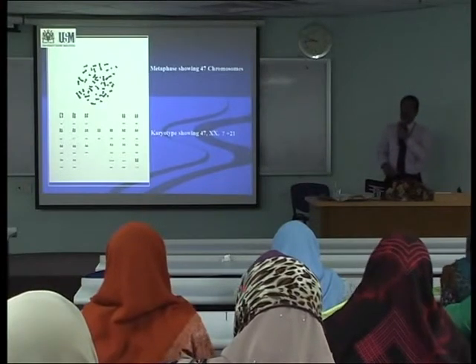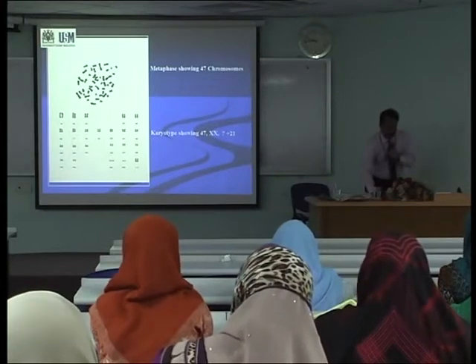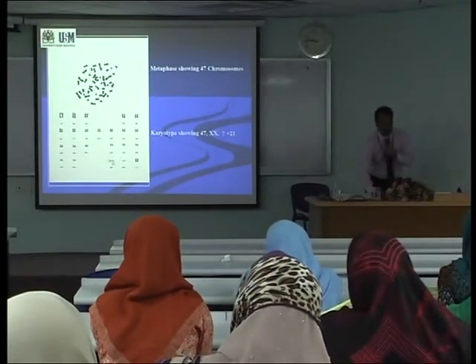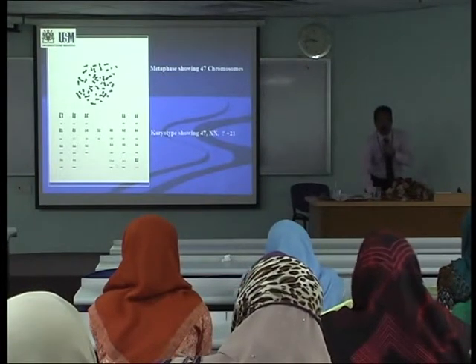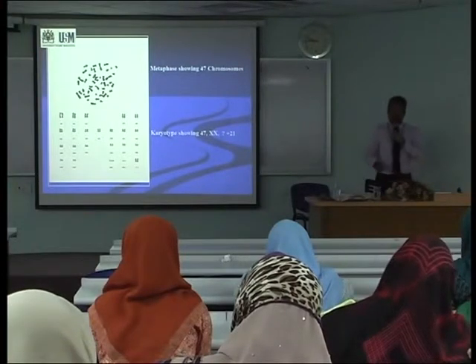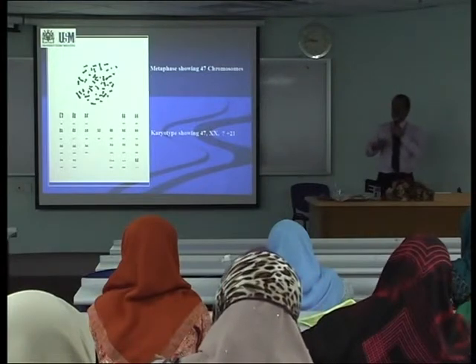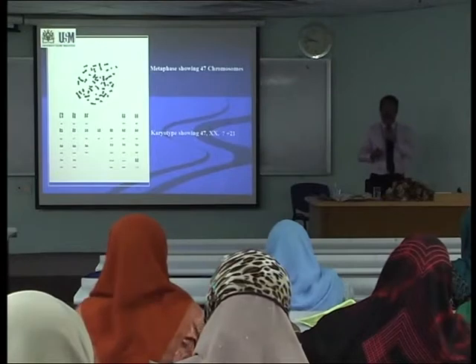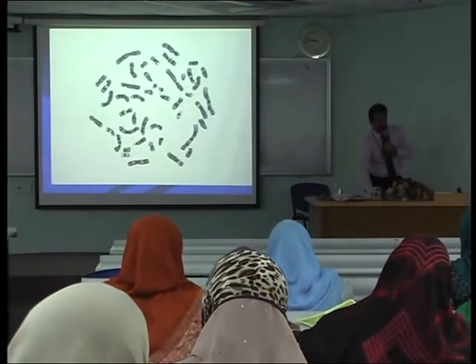But still, this procedure is not correct because you can see the chromosome number 22 also resembles exactly like 21. So we may not be very sure whether the extra chromosome is 21 or 22. In order to confirm that, we had to do another technique known as banding. Once we prepare the slides, we had to do banding, GTG banding, and then stain the chromosomes. Then only we can correctly identify the homologous pairs.